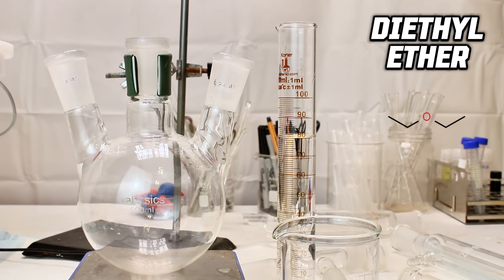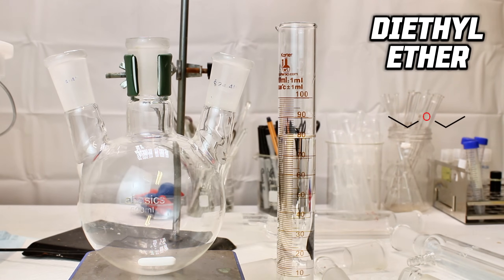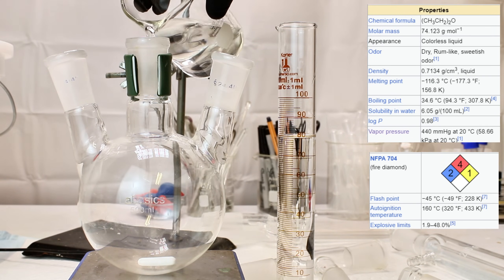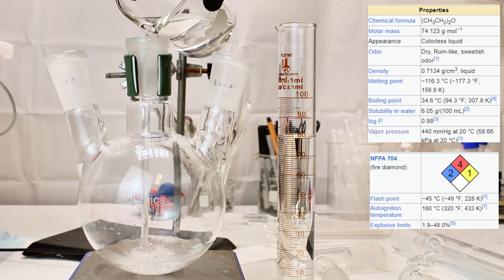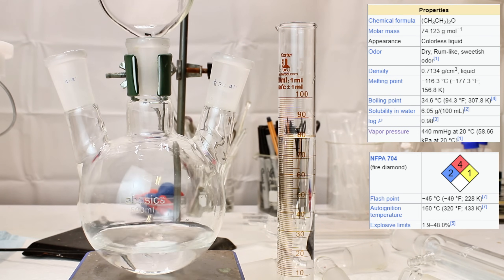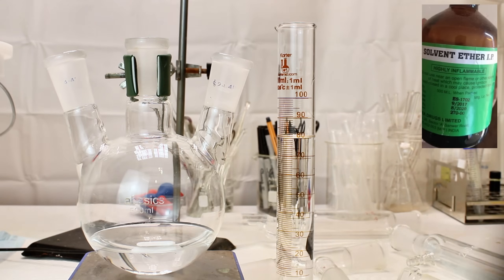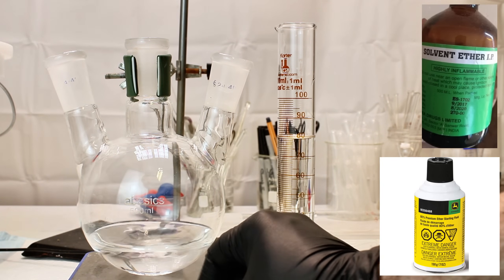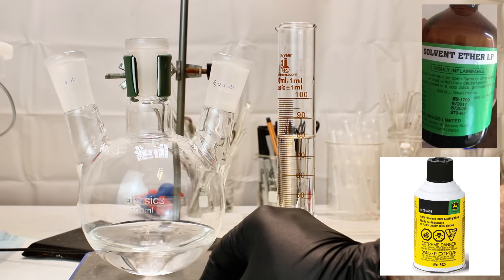One of the few chemicals I regularly make rather than buy at the store or online is diethyl ether, which is more commonly just referred to as ether. Ether is an extremely volatile, dangerously flammable organic liquid that is often used as a laboratory solvent or as a starting fluid in some engines, and it's nearly impossible to buy, at least where I live.